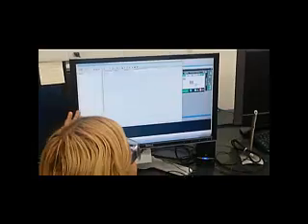Then this is going to start going through contact closure and trying to get ready. While that's waiting, you're going to highlight the second row, hit the test tube again, hit OK again, hit the test tube twice, hit OK twice. So you're going to do the clean 2 times. So you're going to highlight, hit OK. Highlight, hit OK.